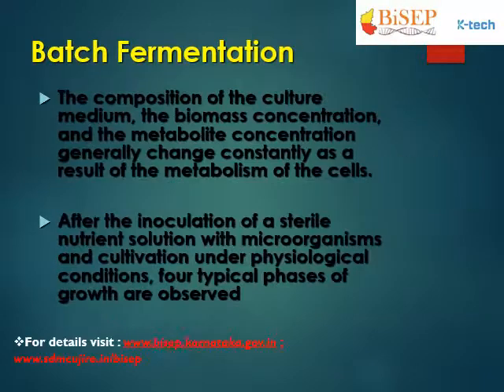In batch fermentation, the composition of the culture medium, the biomass concentration and the metabolite concentration generally change constantly as a result of the metabolism of the cells. Whatever media we have added into the bioreactor for the fermentation occurs as a batch. So here the biomass concentration keeps on varying, and the metabolite concentration also keeps on varying.